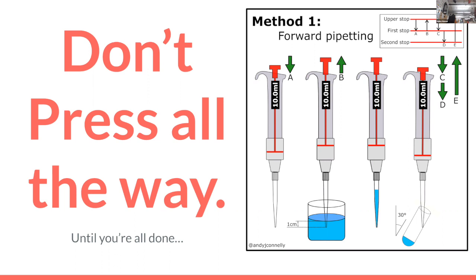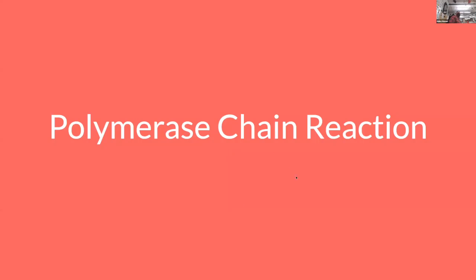But they work with the equipment that's up here. They're just a fascinating tool for dishing out very specific amounts of chemicals. These can be done robotically, so you can absolutely have a CNC machine that does this 100 at a time, which is fascinating. Not something that we have. We're going to do everything by hand, but those machines do exist if you're in a big money lab.